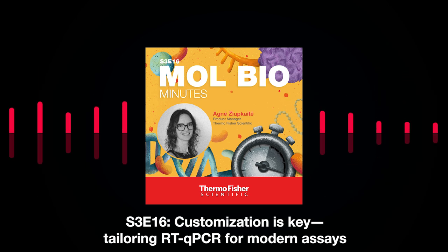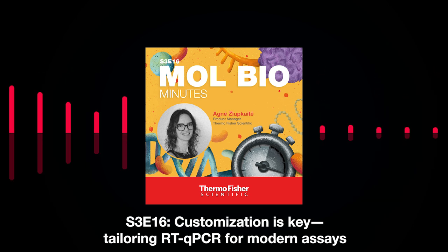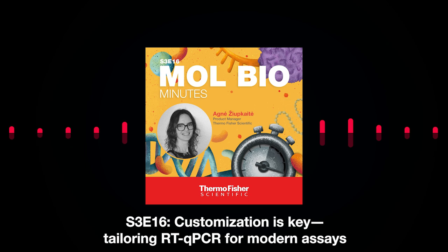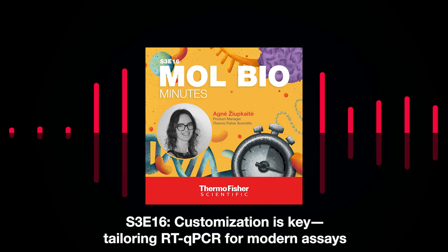Is it reliability, sensitivity, speed, or even possible inhibitors from the sample? I do believe that at least one of those concerns popped up recently. If you have never faced those challenges, you are the lucky one.